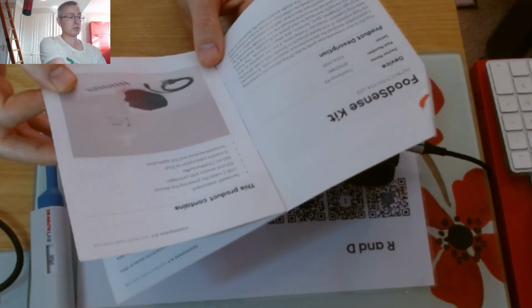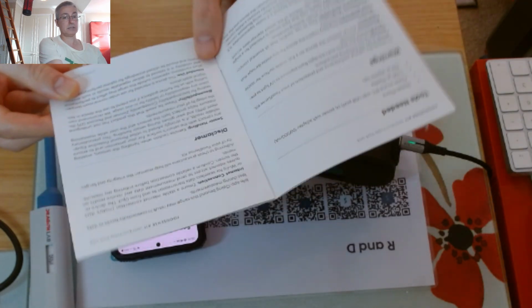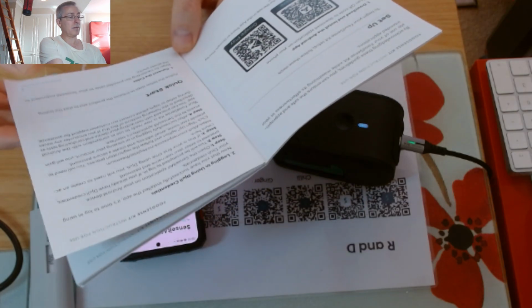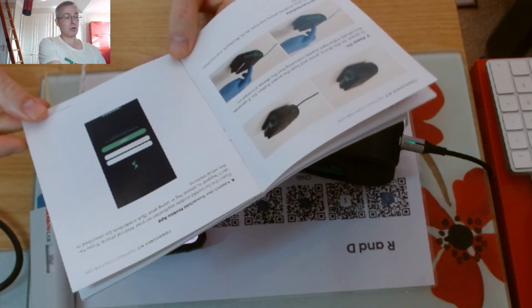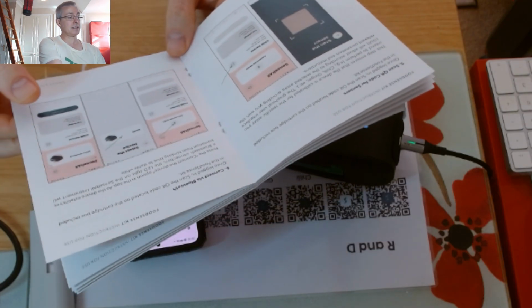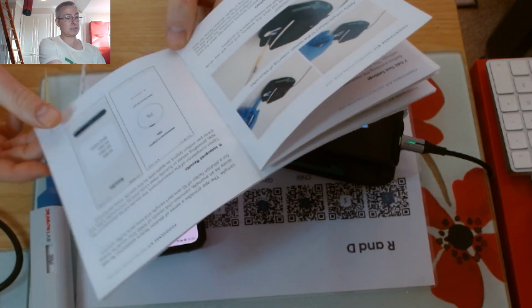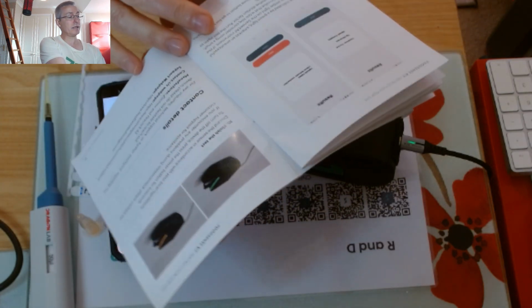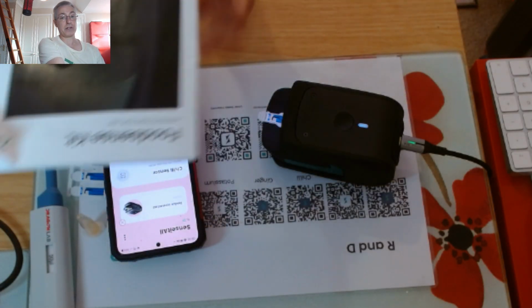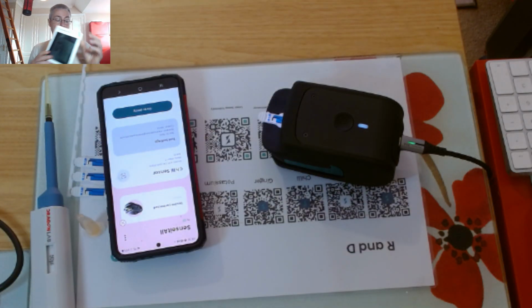It talks about what's in the box, tests, tools needed, disclaimers, where to get the app from, how to turn the instrument on, how to start a chili assay, let's say, how to make a Bluetooth connection, how to do settings, how to add a sample, what you can expect when it's running, and also the status of the instrument. So we do have very good, let's say, real world literature on this. It's in the form of the manual.